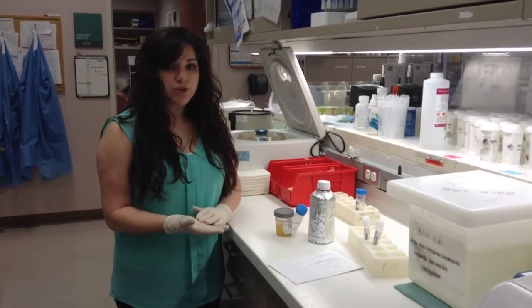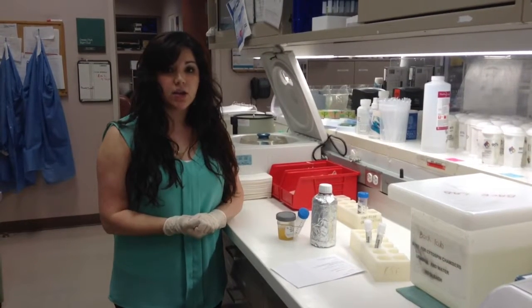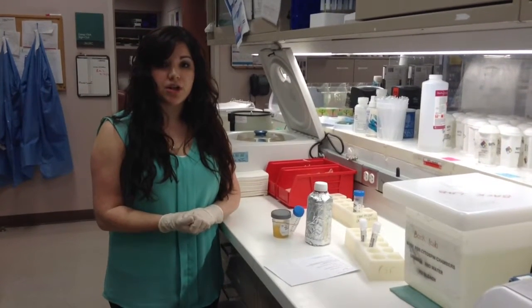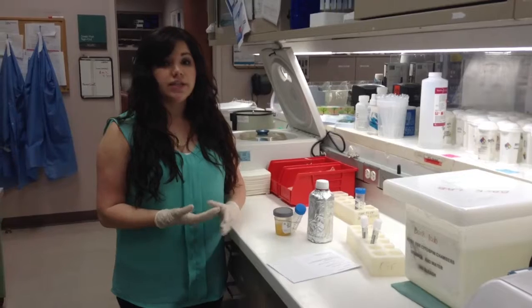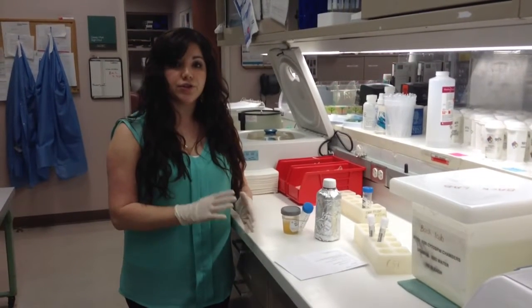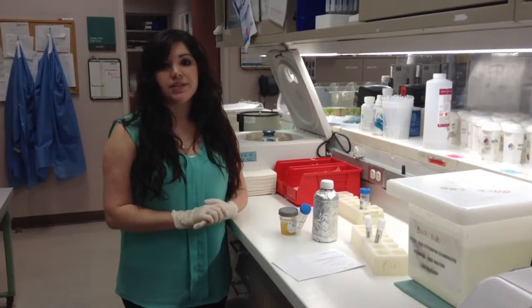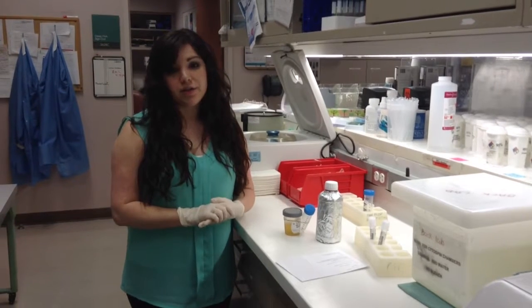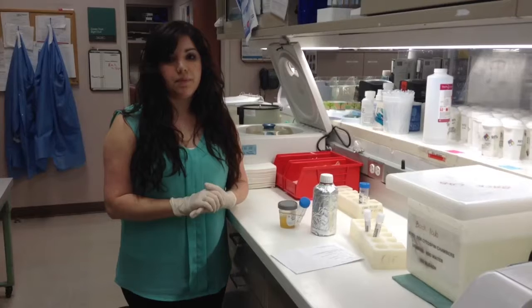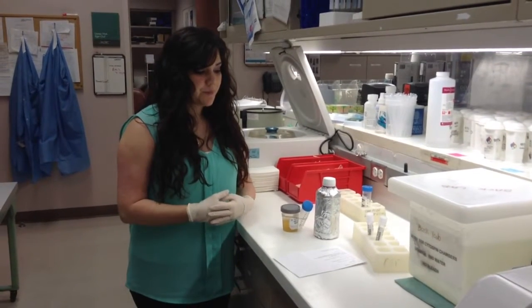On this day, you'll also want to be sure to explain the purpose of using acetic acid in our urine processing, as well as the purpose of adding RPMI for lymphomas to our CSF cases. The student does have the opportunity to review the procedures, an abbreviated version of our procedures that's easy to understand and going to be presented to them in a simple format. Please encourage them to study these procedures before coming each day so that they can give their best work on the day of their rotation.